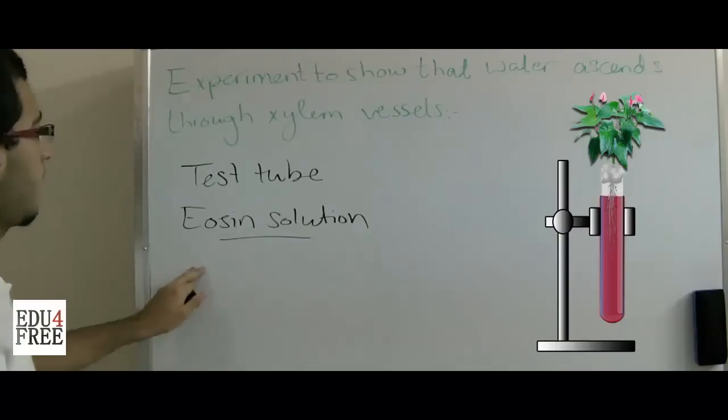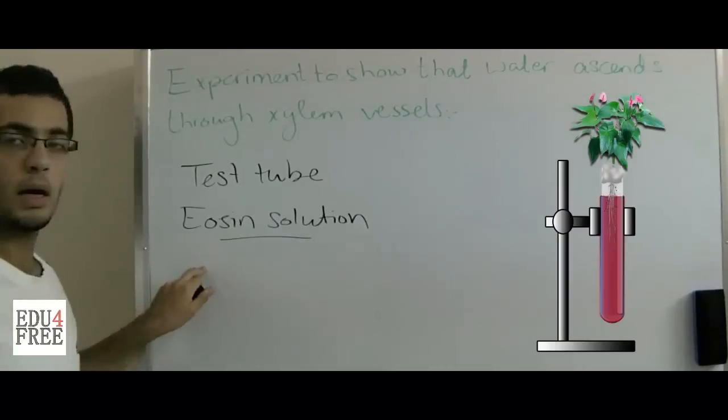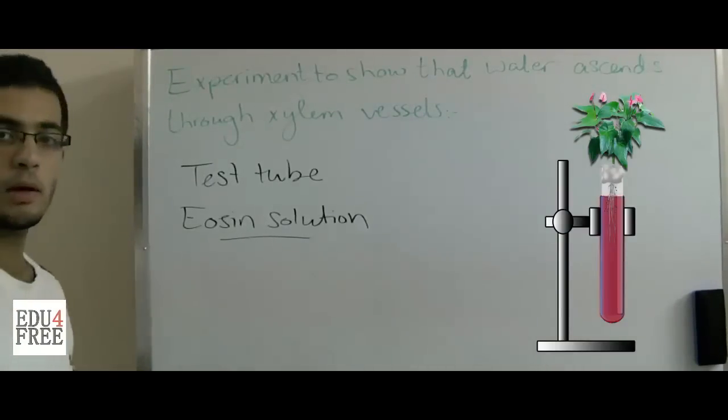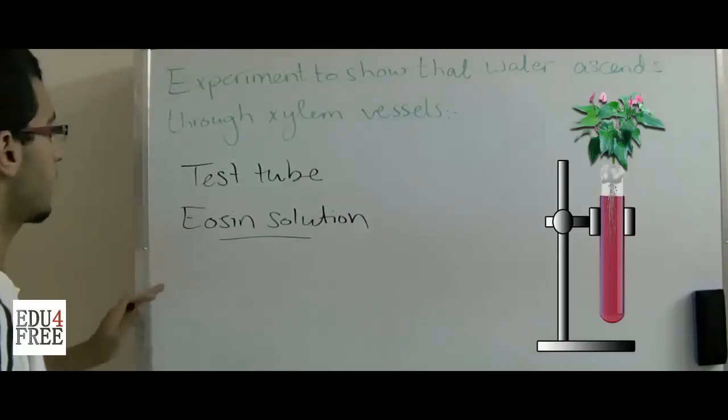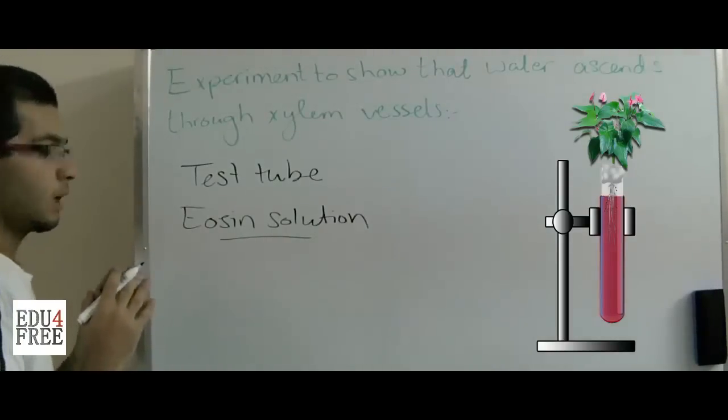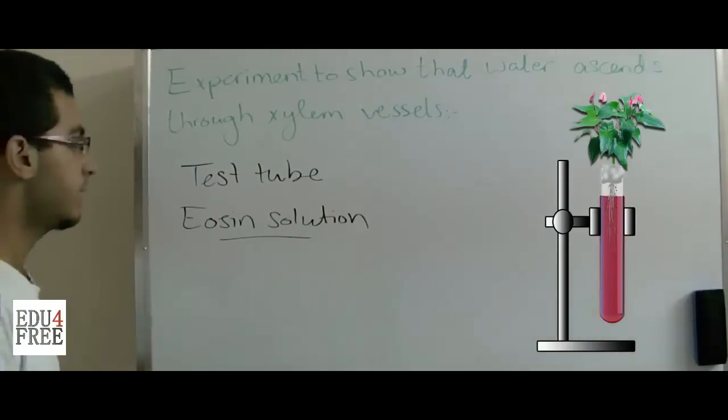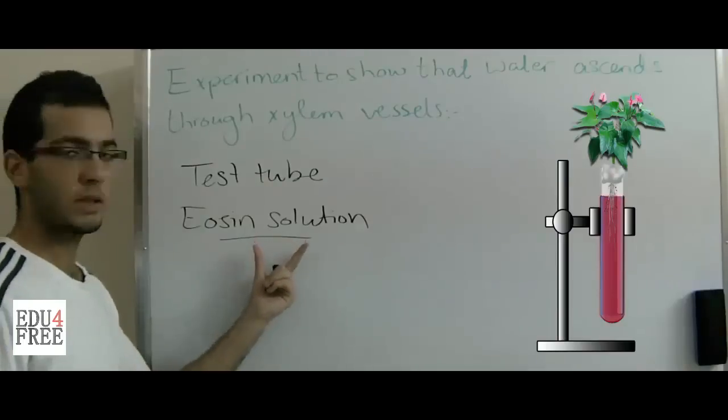We are going to dip a small flowering plant into this test tube so that the root system is immersed in the eosin solution.